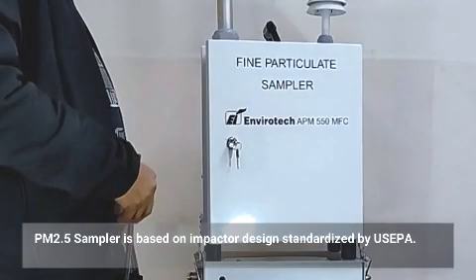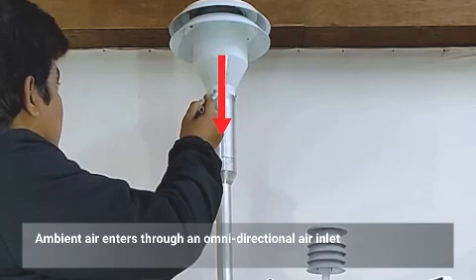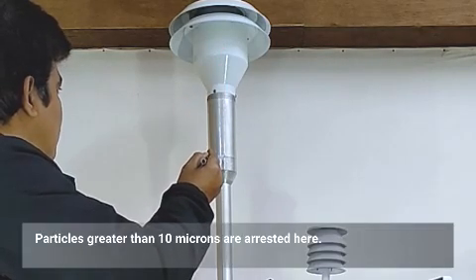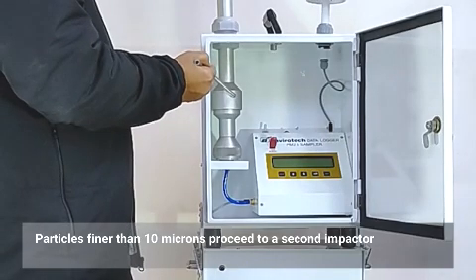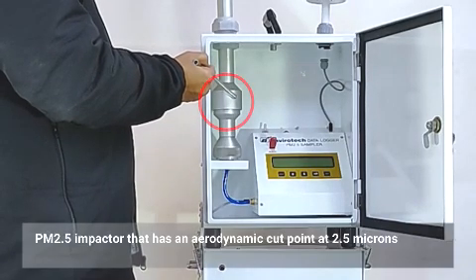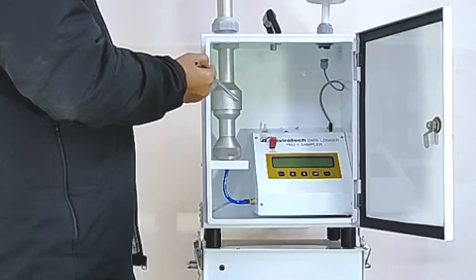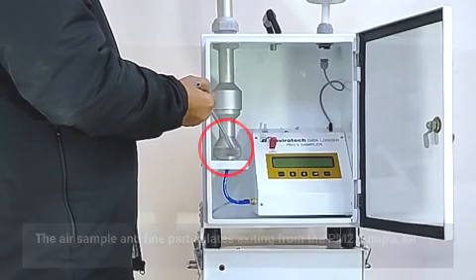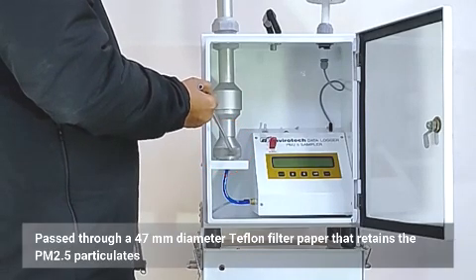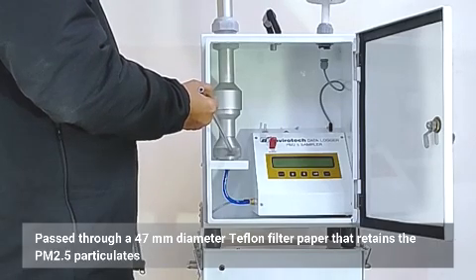The PM2.5 sampler is based on an impactor design standardized by US EPA. Ambient air enters through an omnidirectional air inlet. Particles greater than 10 microns are arrested here. Particles finer than 10 microns proceed to a second impactor, the PM2.5 impactor, that has an aerodynamic cut point at 2.5 microns. The air sample and fine particulates exiting from the PM2.5 impactor are passed through a 47 mm diameter Teflon filter paper that retains the PM2.5 particulates.